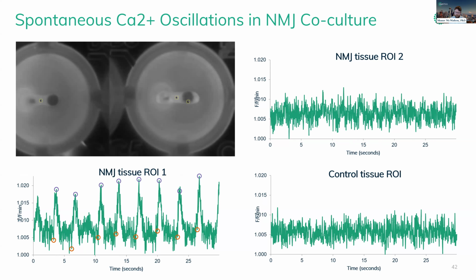For calcium imaging, unfortunately, the blue light produces large imaging artifacts. But we're still exploring this measurement methodology for calcium imaging to observe the physiology in a potentially higher throughput format.